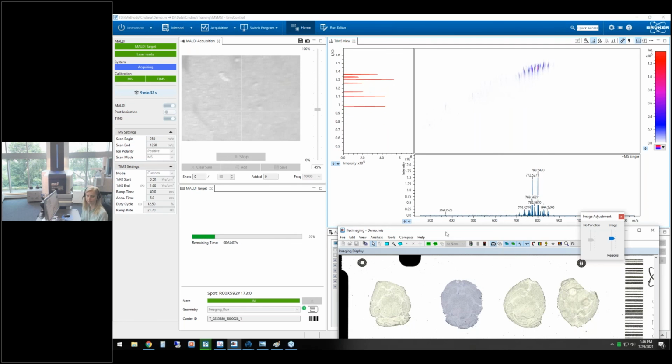So it's really just a matter of how the software is reading the data. What you have to import into Metaboscape is the region of interest, so those outlines that I showed you, blue, green, or pink. It's just a matter of how it reads the data, and that's why you have to do an import.